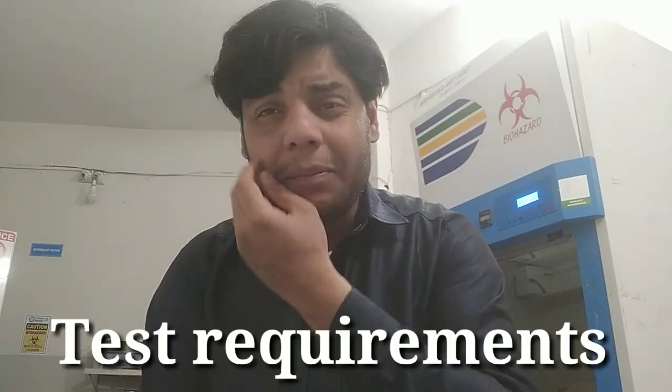After that, due to the metachromatic property, what will happen? The metachromatic granule, which is blue, will appear in a reddish-pinkish color. Okay, so this is actually the principle of this Albert staining.